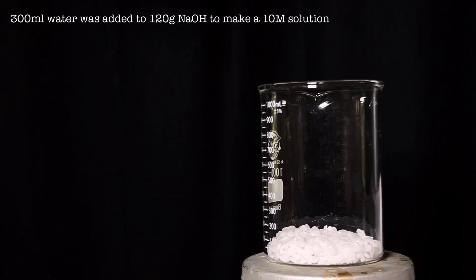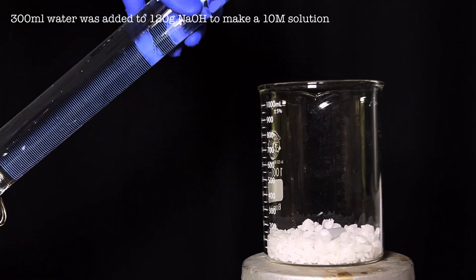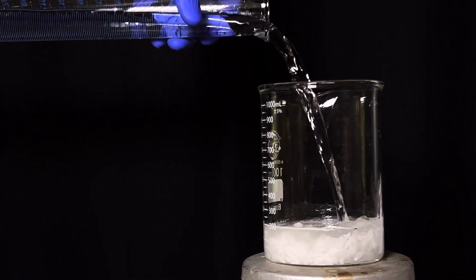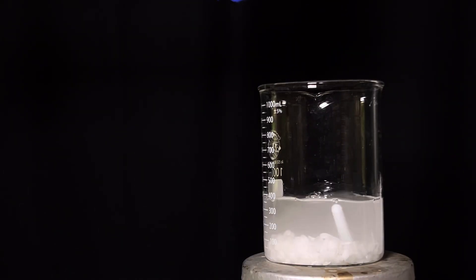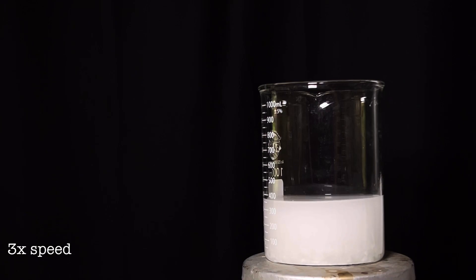Now in another 1000 milliliter beaker, 120 grams of sodium hydroxide was taken and a steering bar was placed inside. 300 milliliters of water was added to the beaker using a graduated cylinder. The dissolution of sodium hydroxide in water is extremely exothermic. Be careful while handling hot concentrated sodium hydroxide solution as it is extremely corrosive.